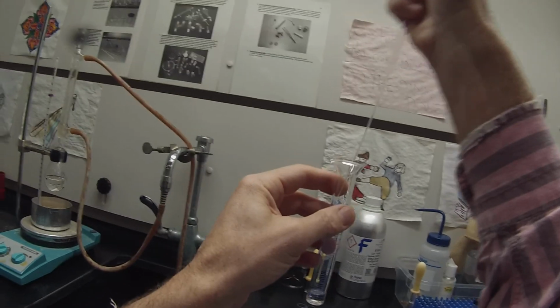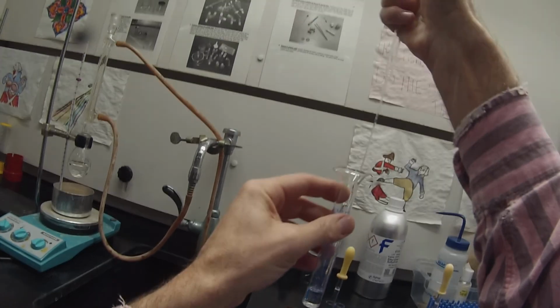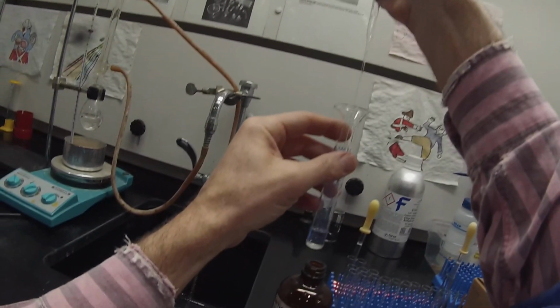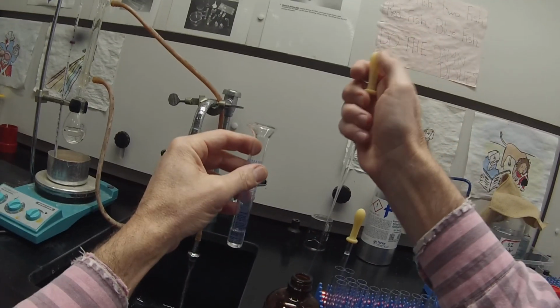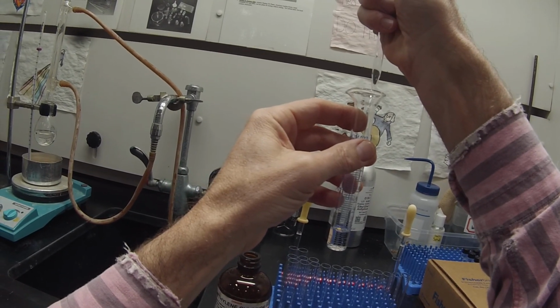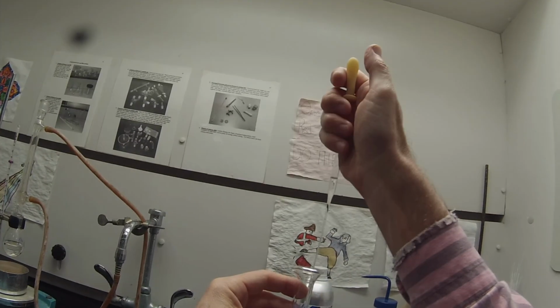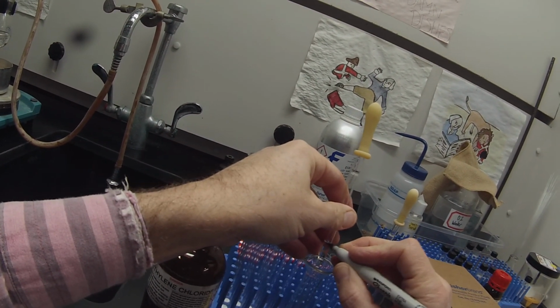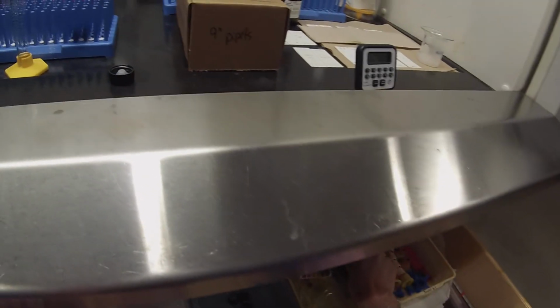It's actually really hard to read the numbers down low like that. So I'm going to put 2 milliliters in. And I'm going to take half a milliliter into the pipette. So that's at 1.5 milliliters. I'm going to use a Sharpie to mark the level in the pipette, so that I'll know how much I want to remove each time.